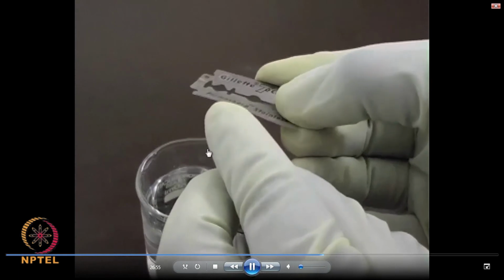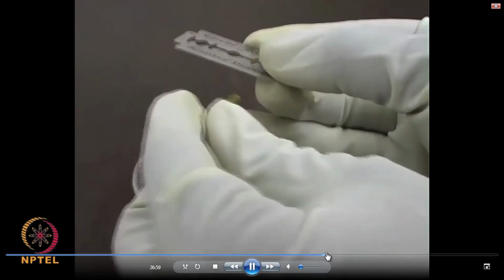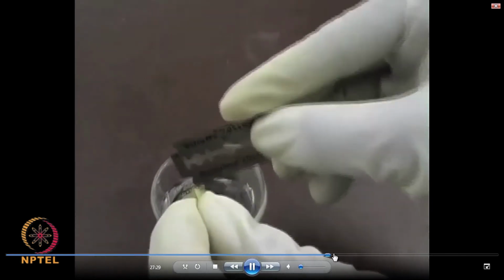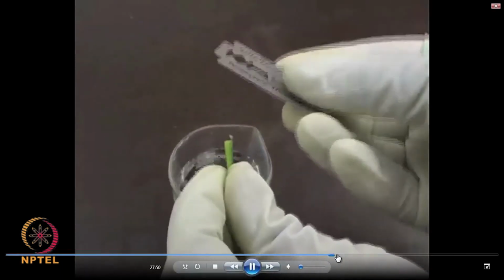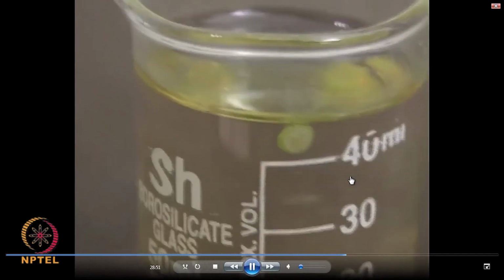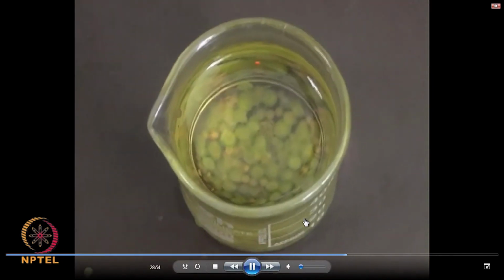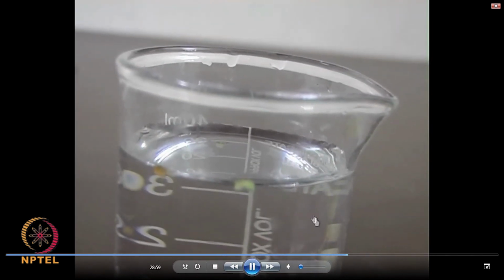The earlier one was a banyan tree root. Once you make slices and collect them in the beaker, you have to choose only very thin and transparent samples for examination. The one which is floating on the water is most suitable and good for microscopic analysis.